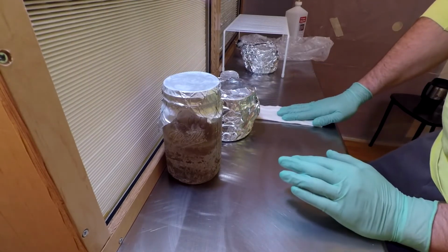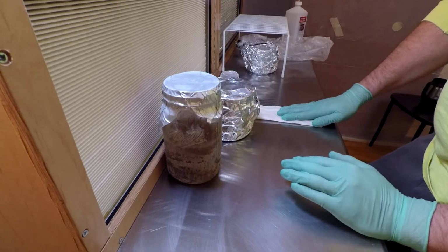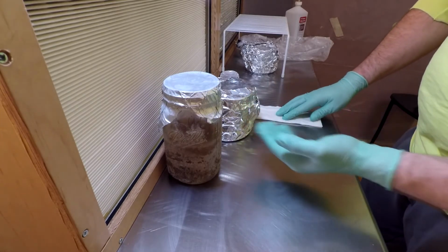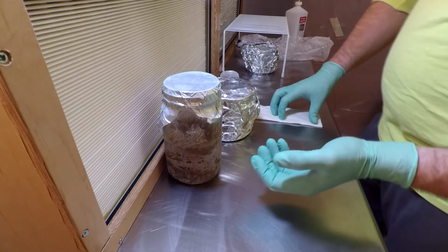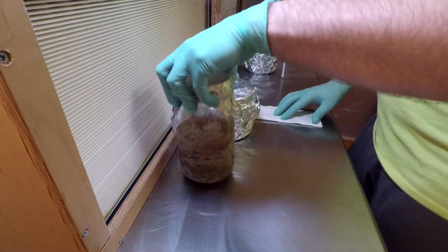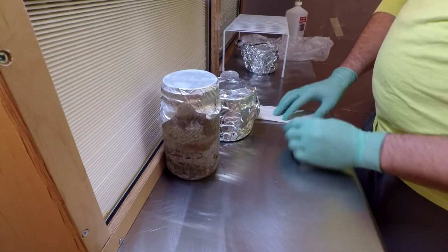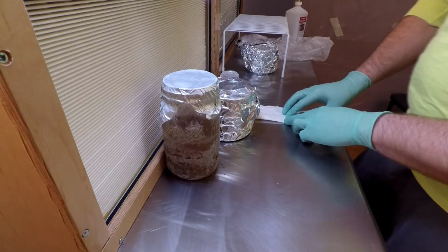So it's probably going to be about another 10-20 minutes before this is cool enough. Being in front of the flow hood is going to cool it off fast. So I'm going to come back out here every 10 minutes, check the jar, see if it's cooled down, give it a swirl, make sure it's still thin. And then once it's cooled down enough, we'll start inoculating some of these dishes again.